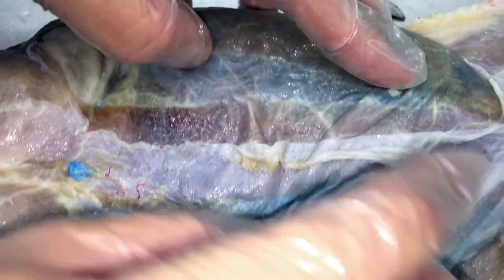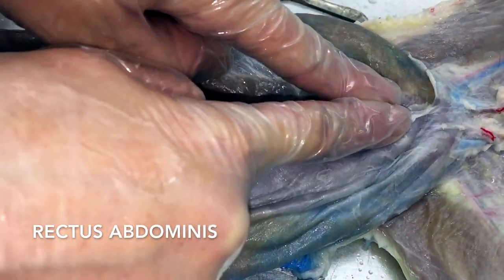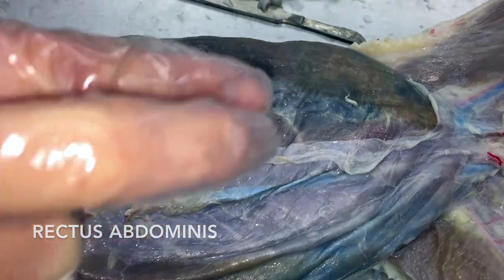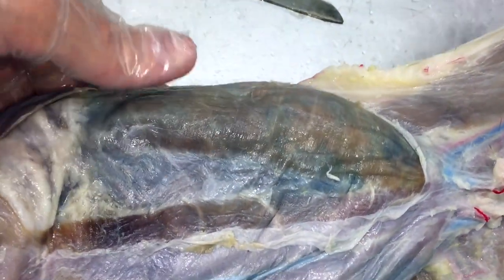Running down the center is going to be your rectus abdominus right here — these are your six-pack ab muscles. So just one more time: rectus abdominus, transverse abdominus, internal obliques are here, and then the flap on the outside is going to be the external obliques that cover everything.